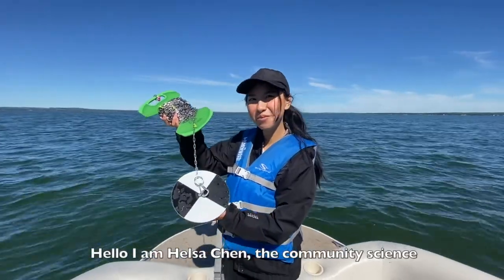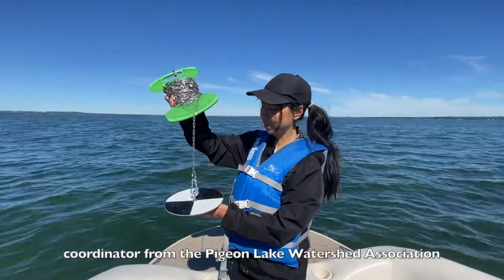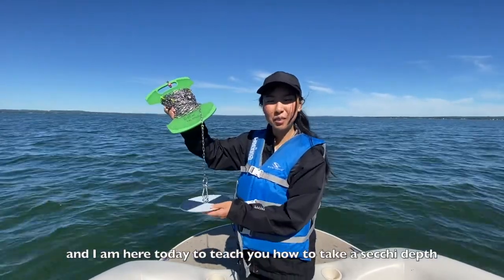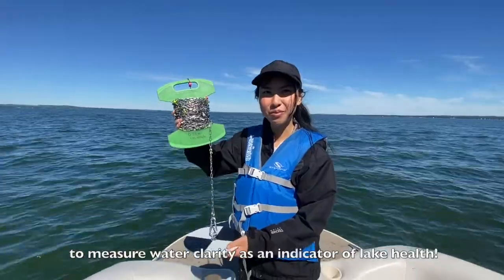Hello, I'm Hilsa Chen, the Community Science Coordinator from the Pigeon Lake Watershed Association, and I'm here today to teach you how to take a Secchi depth to measure water clarity as an indicator of lake health.